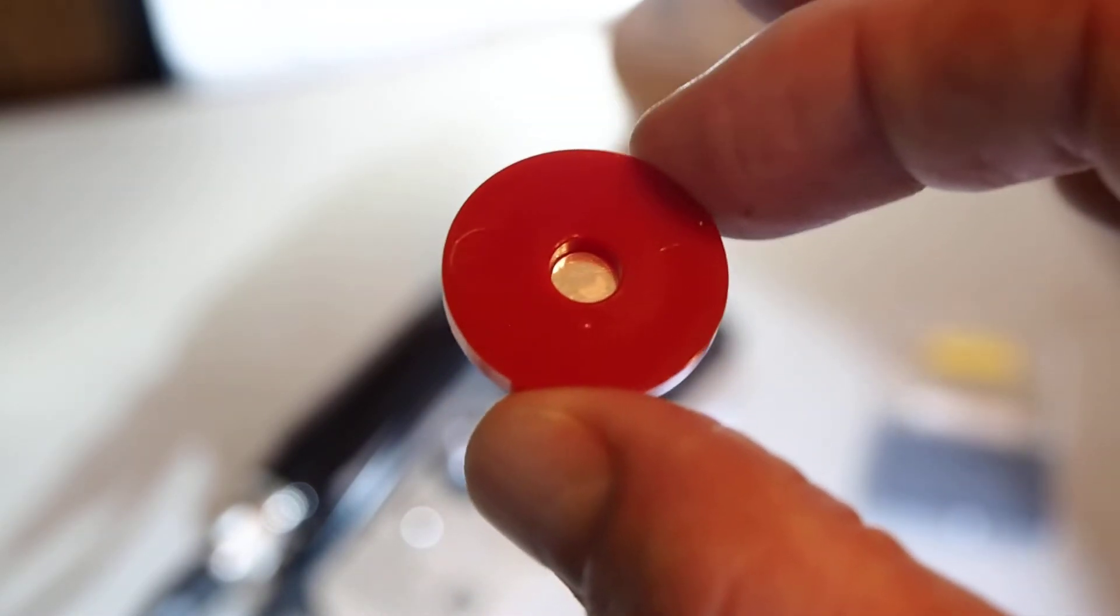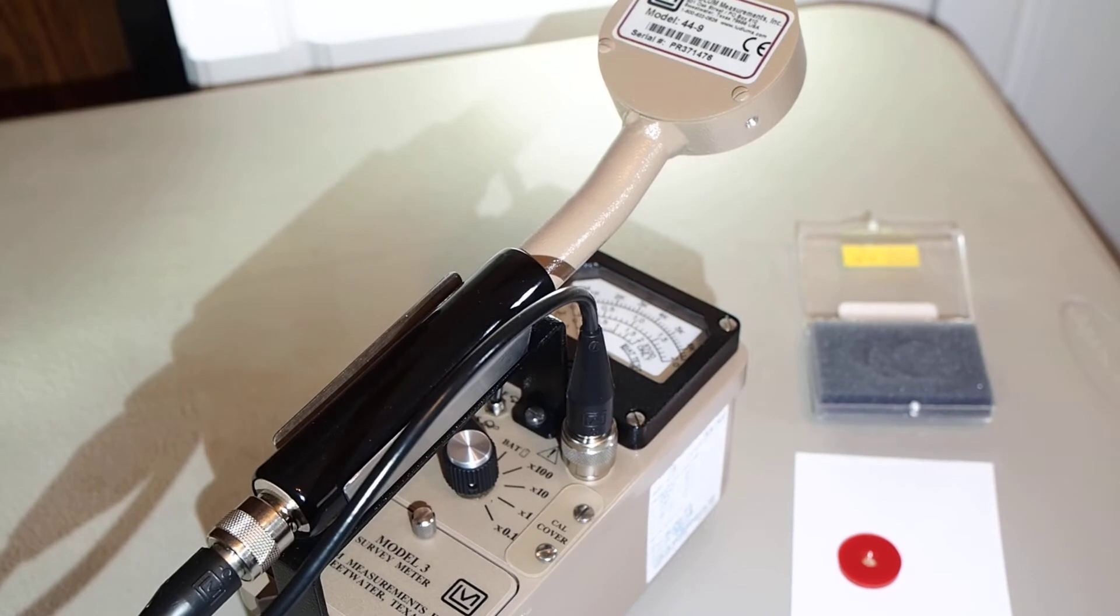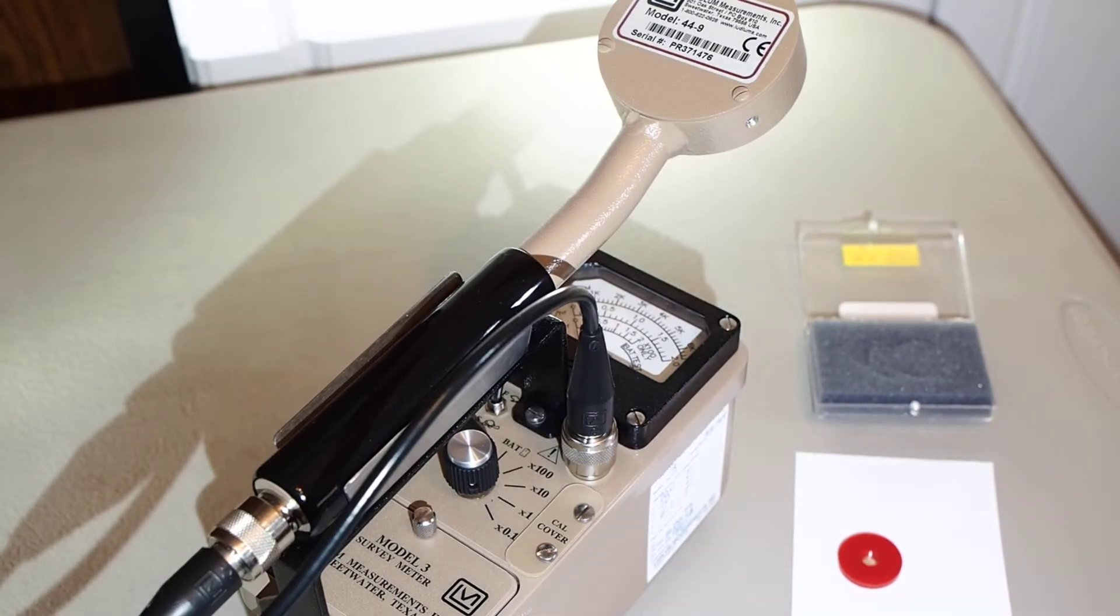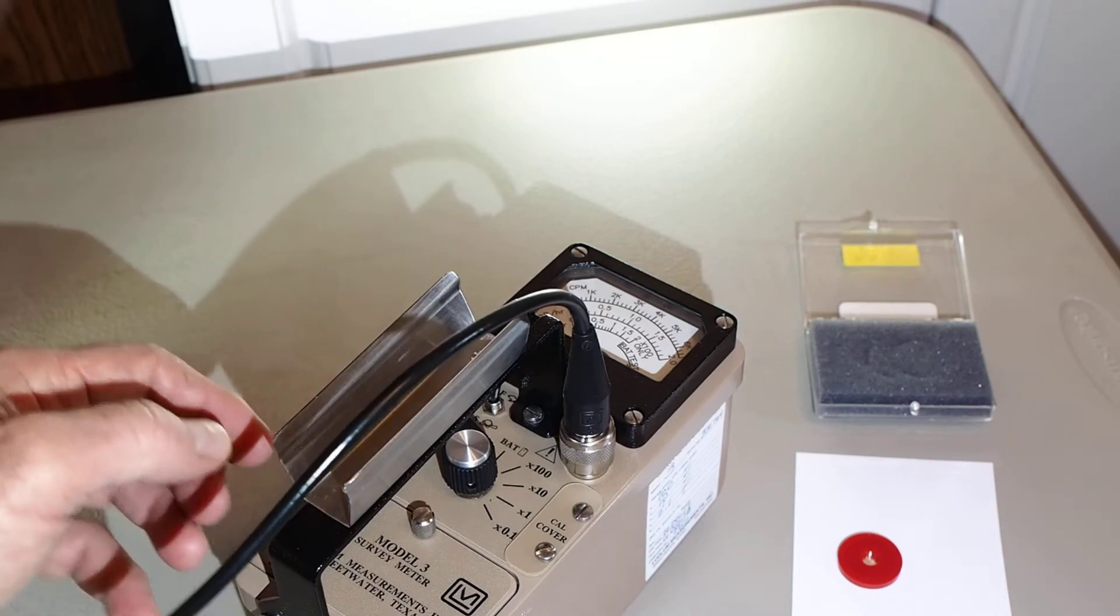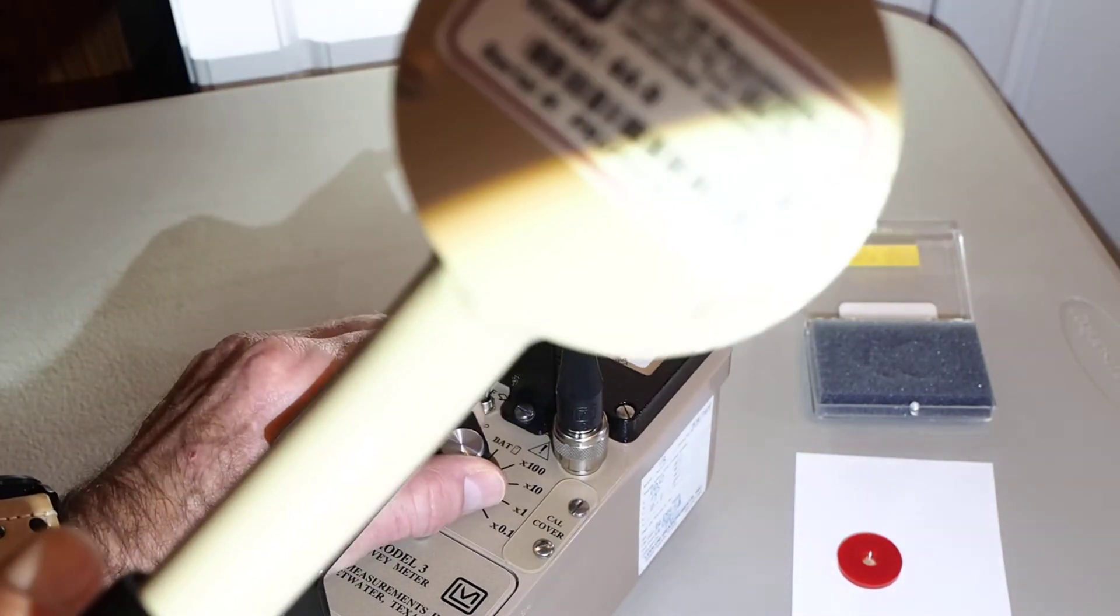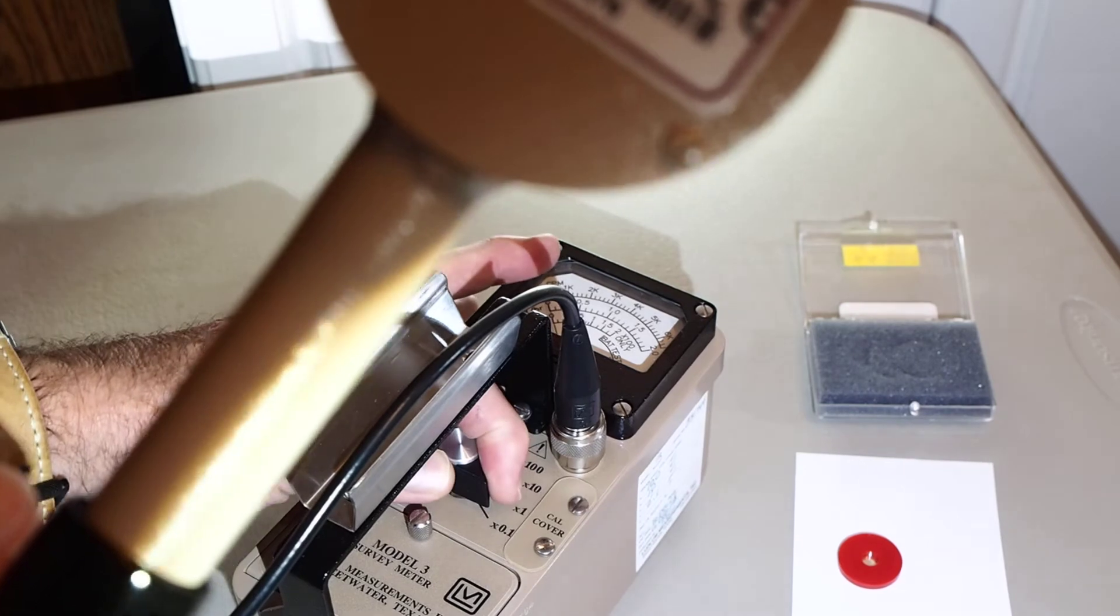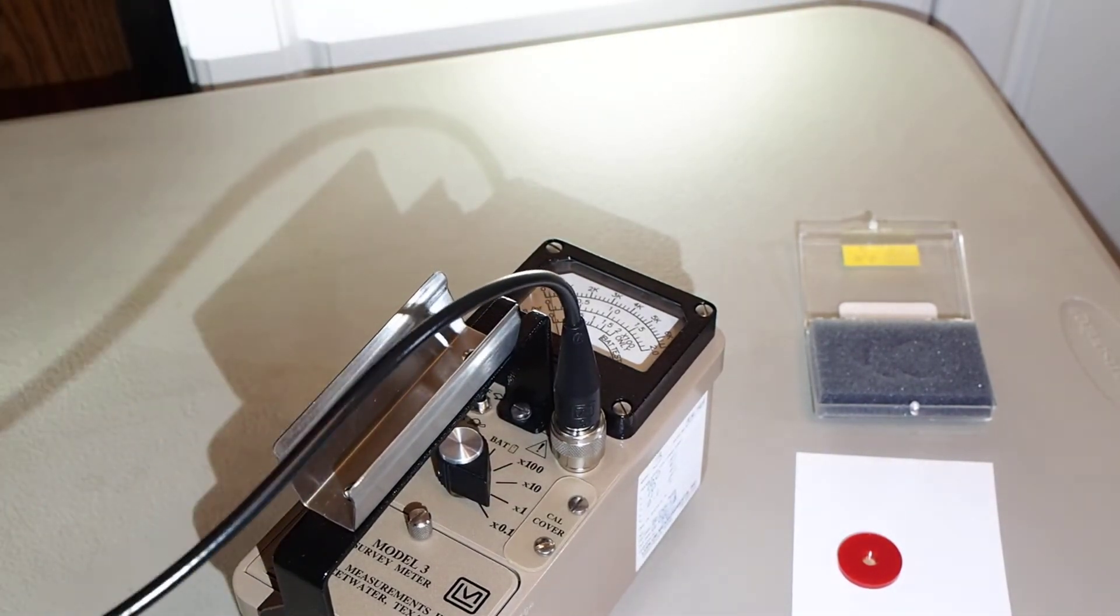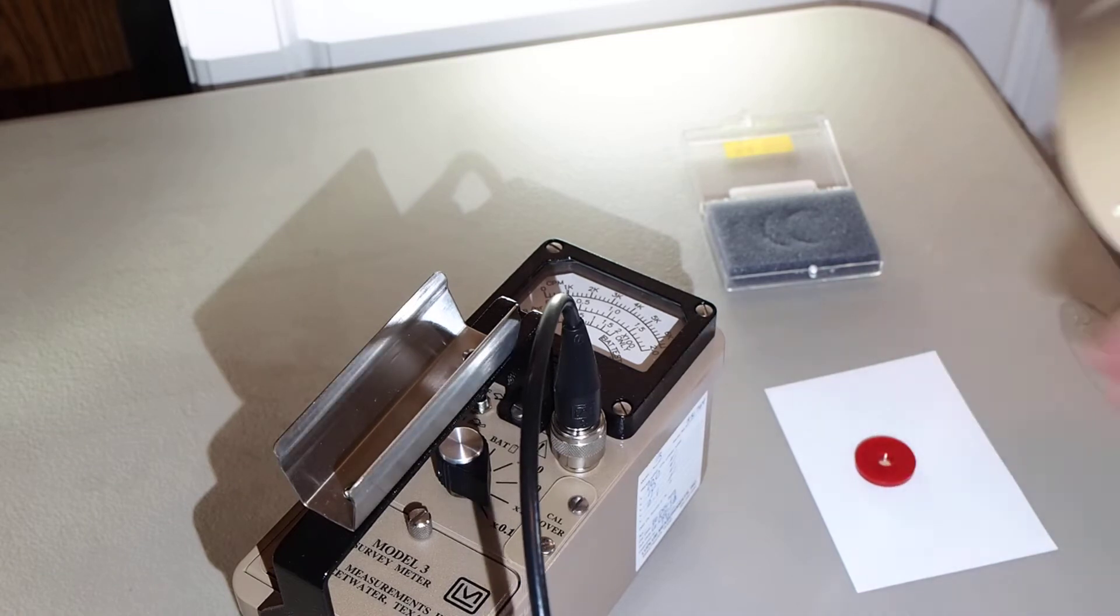So we'll go ahead and take a couple of readings of this and see what polonium-210 does to our meter. We'll move our detector. Check our battery. Showing good for battery. We'll start off on the 0.1 scale here. Reset our instrument.